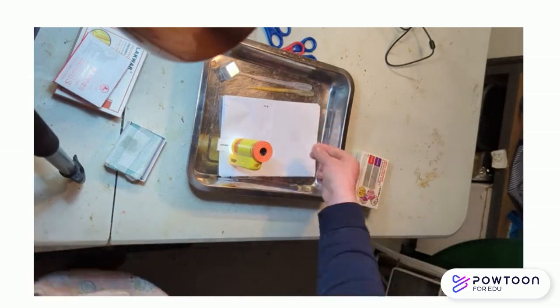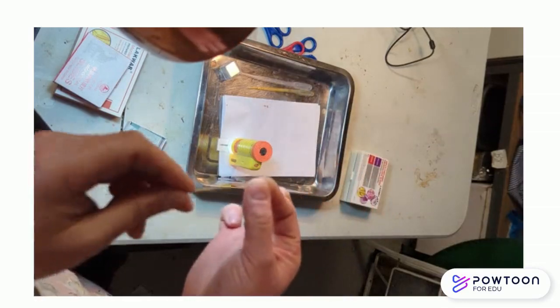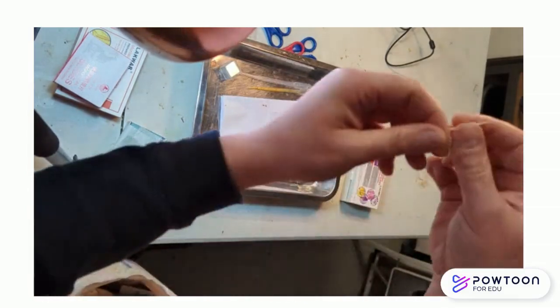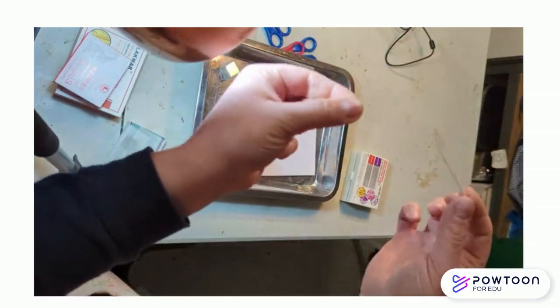Always have white paper. I really recommend it. Make sure your students know how to use a slide. Clean, nice slide. And before you start, get them to practice on how to put the cover on, making sure that there's not a lot of air and dust on it.